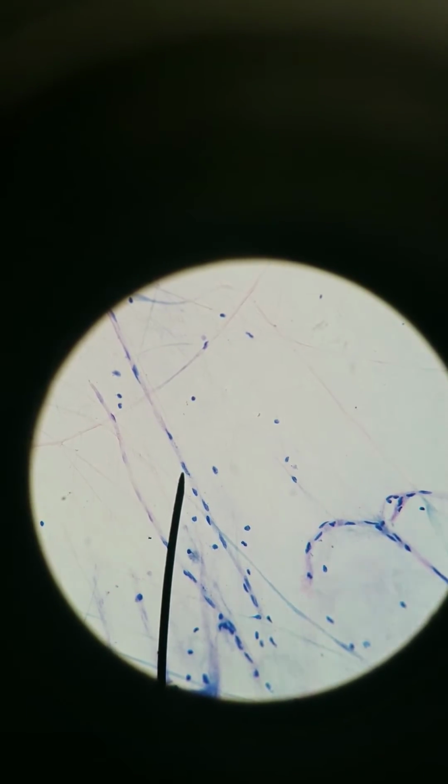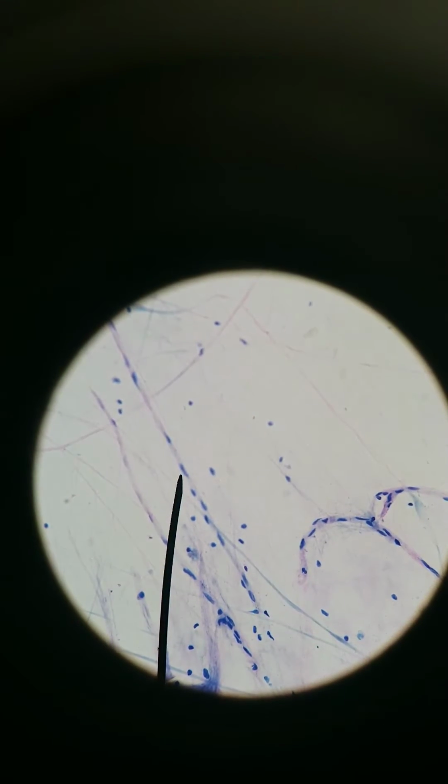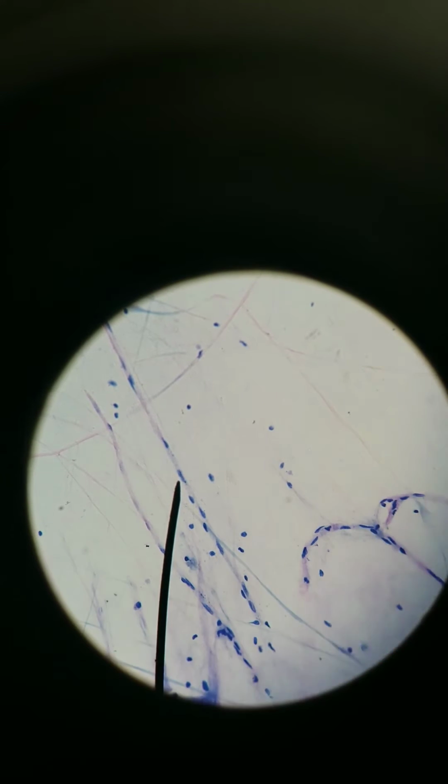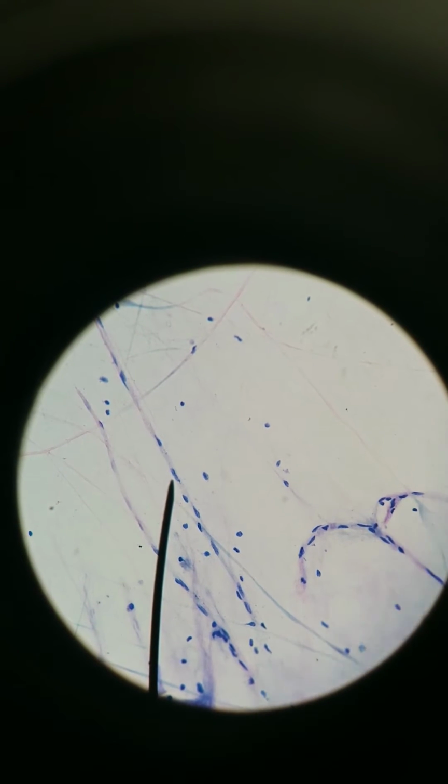So since we have a spinal cord smear, these are probably oligodendrocytes. I guess I can't tell exactly because these neurons' cell bodies might be in the spinal cord, but might extend outside of the spinal cord.